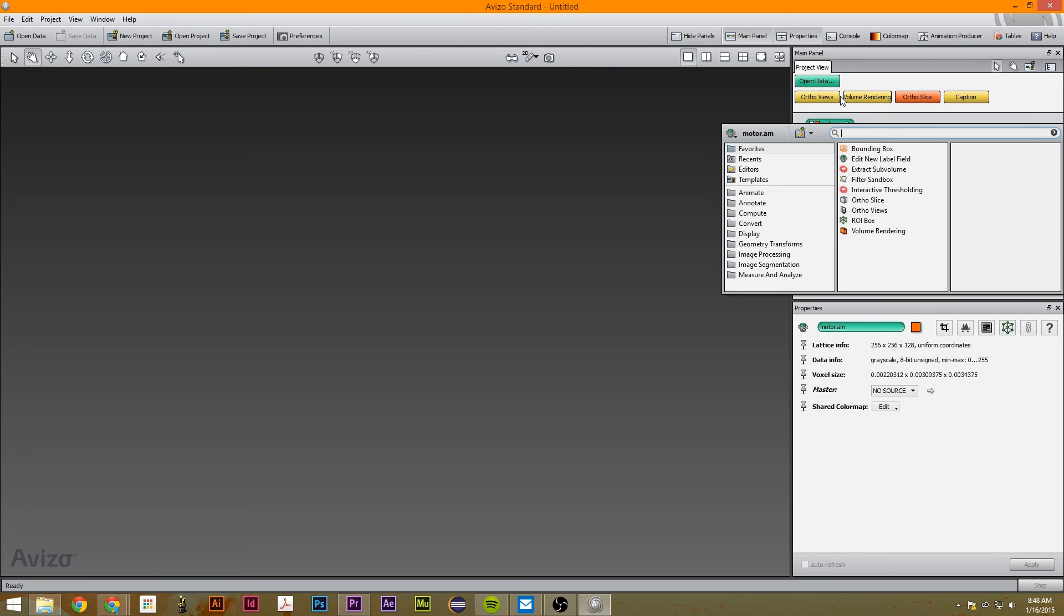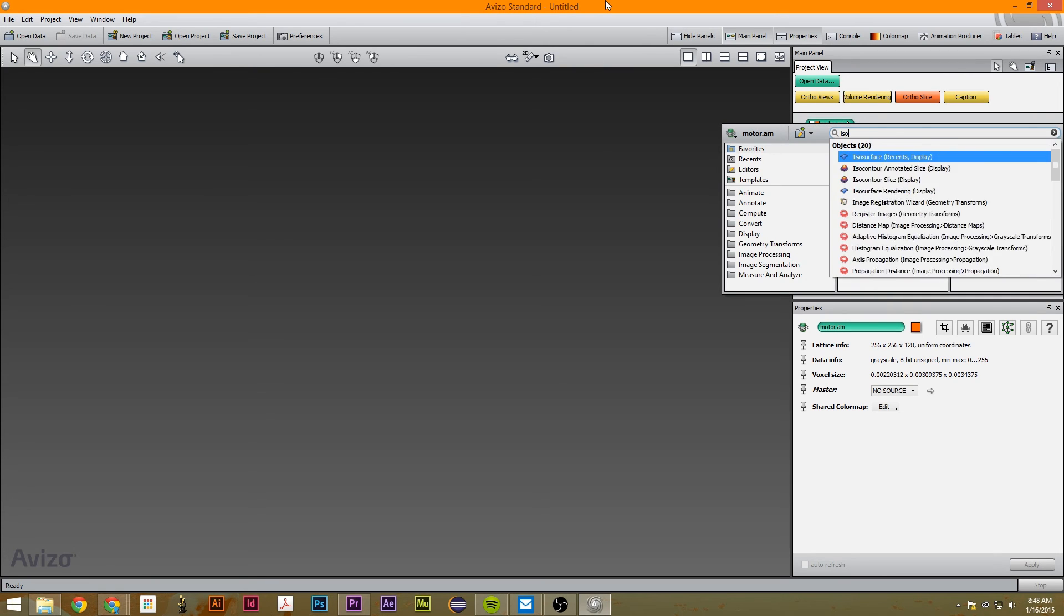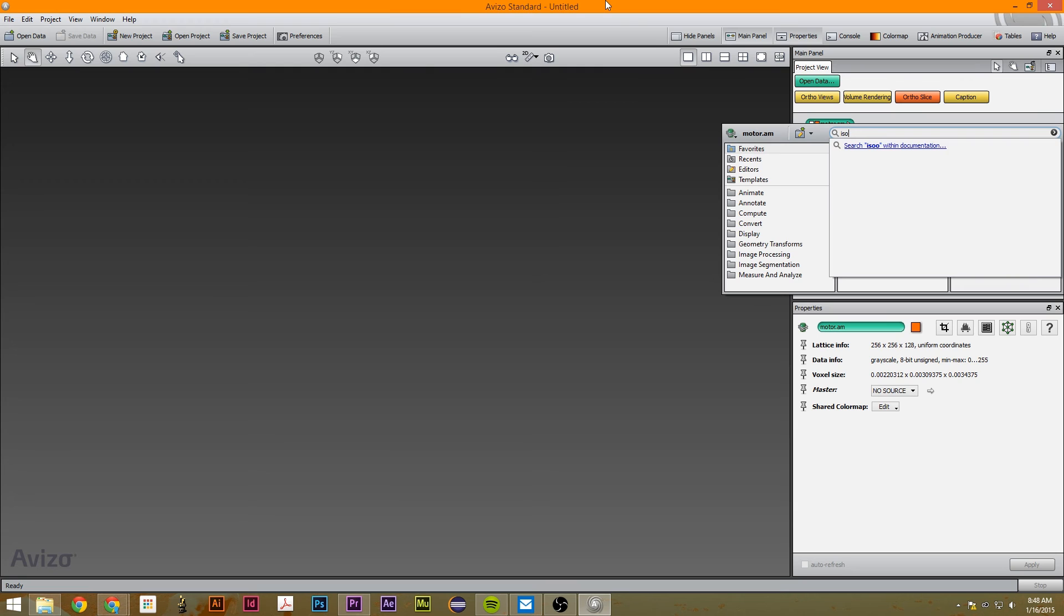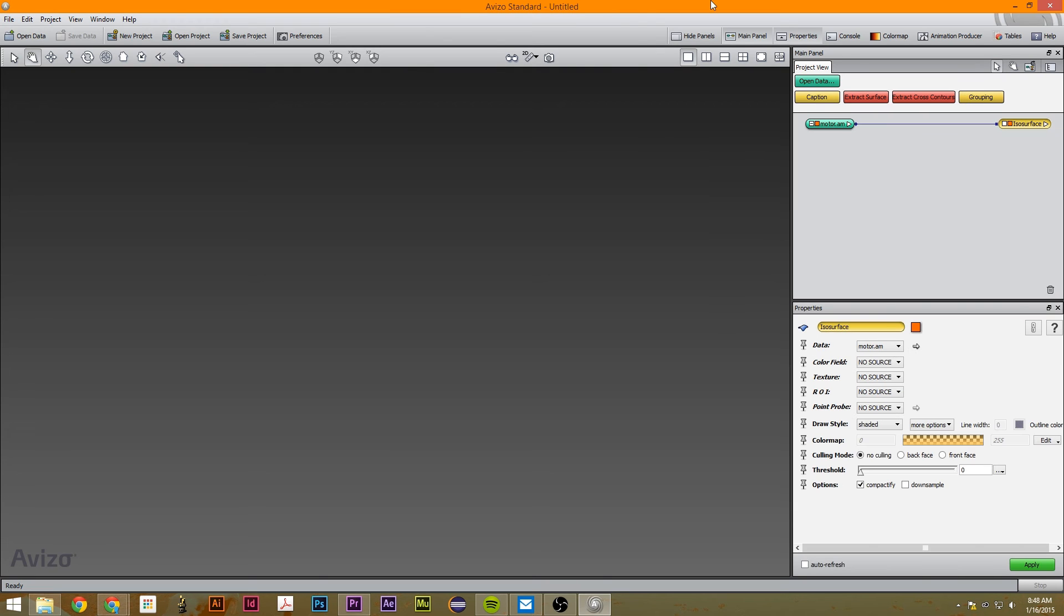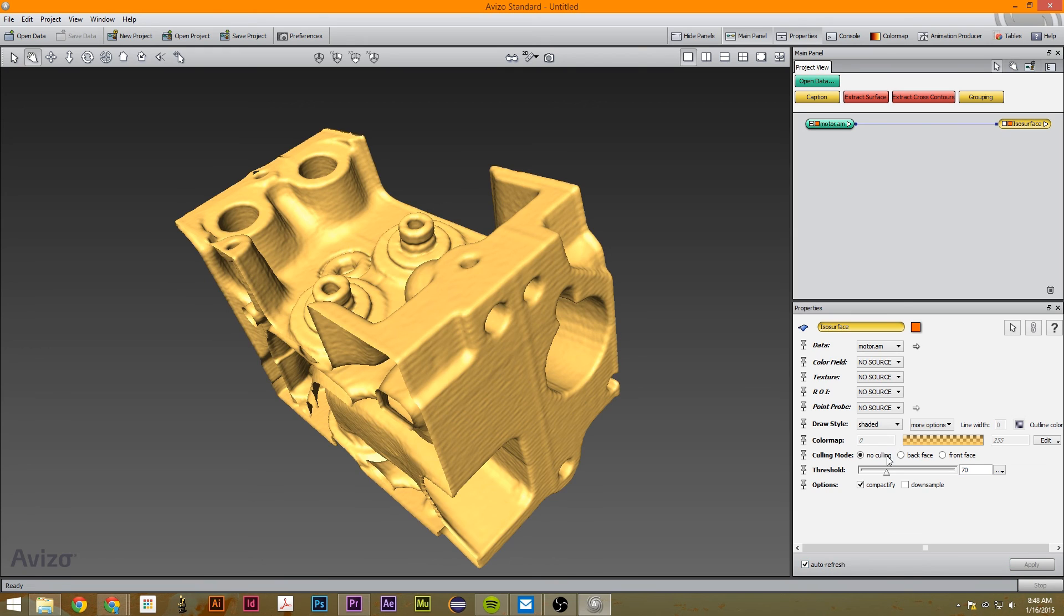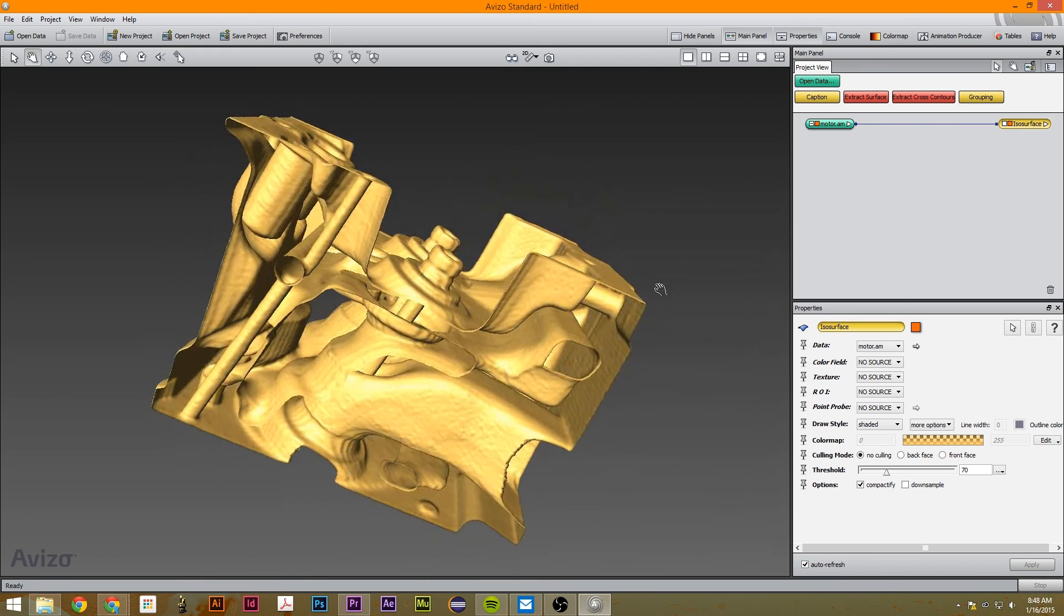And we're just going to click here, and let's search ISO surface. So we want this threshold to be about 70, and then I'm just going to click auto refresh.